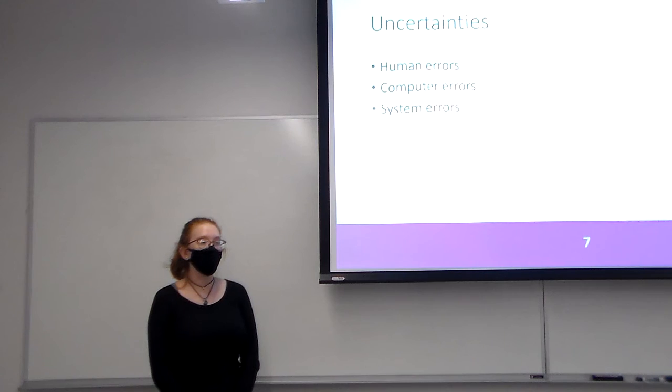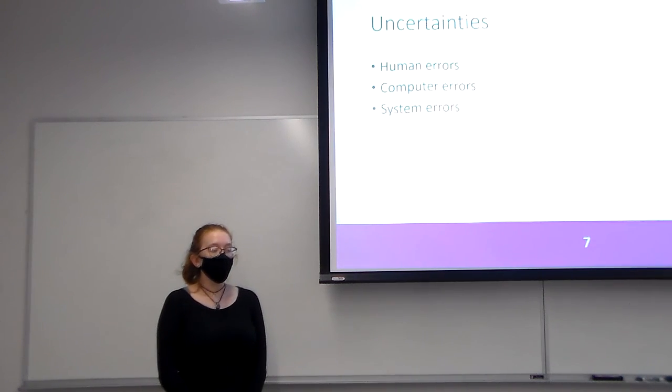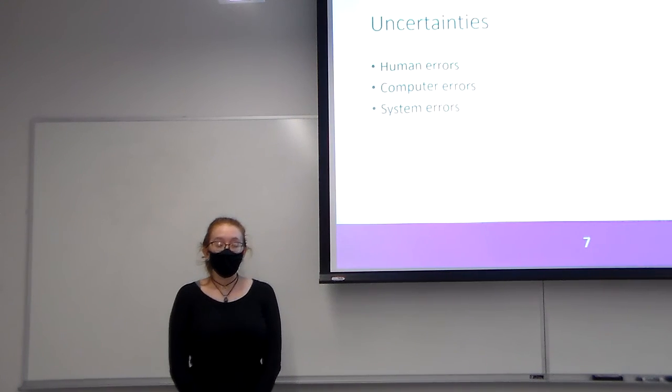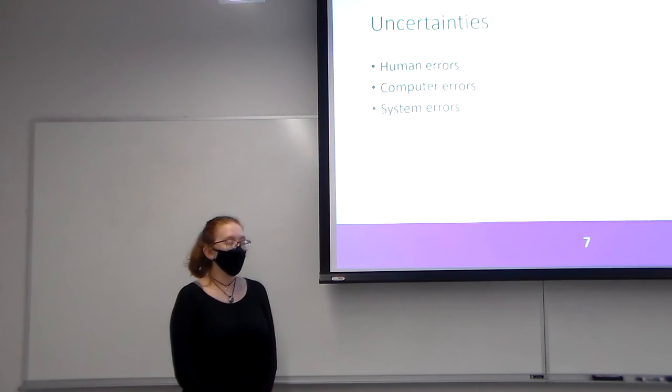For this lab, there are a lot of uncertainties. I don't know about y'all, but I've never used a bomb calorimeter. So there are the uncertainties of operating it, especially when you don't know if something is going wrong, or if what you're doing is right. So you really have to take your time and figure out the errors that could result from it.